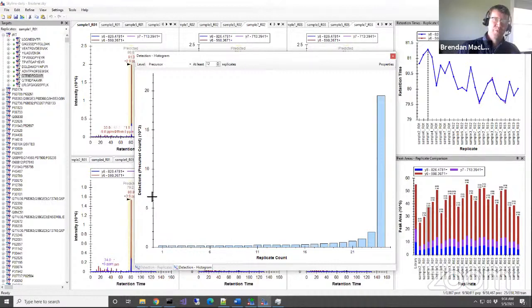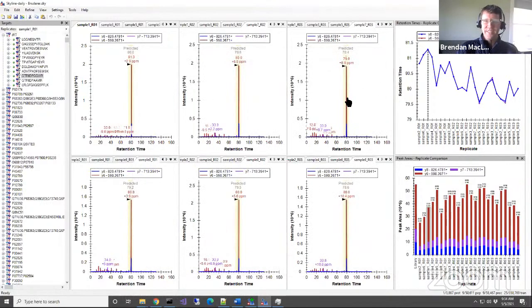What we really don't want to see is another peak over here. If there were a really big set of things that were only seen in one run, that would be indicative of false discovery rate accumulation. So that's how you use those graphs. That's all just statistical assessment that gives us a pretty good feeling of how this stuff was acquired and processed, that our settings were right, and we should feel pretty happy about this.